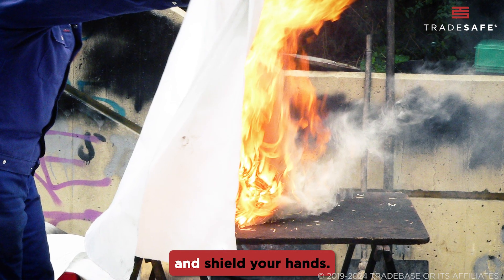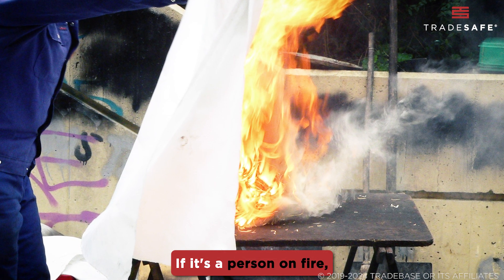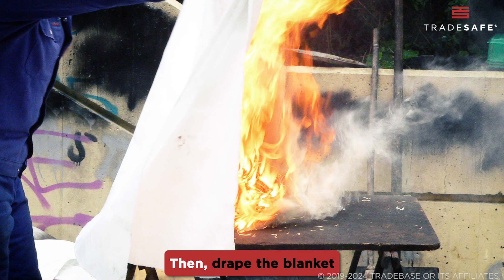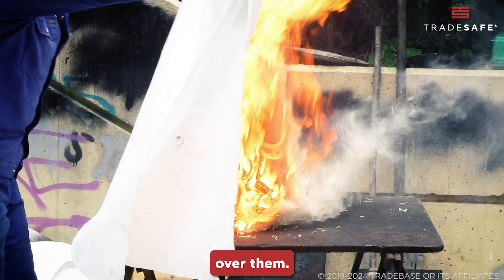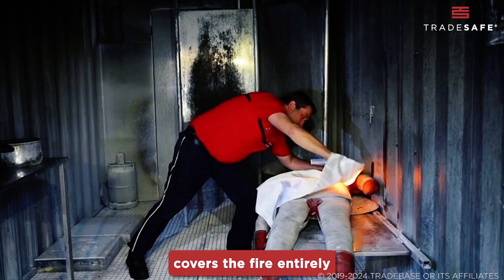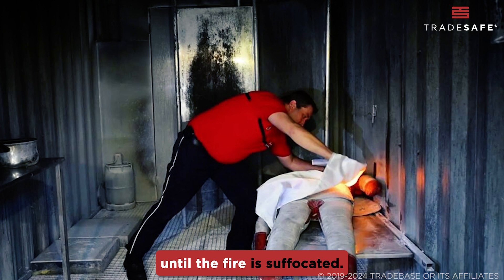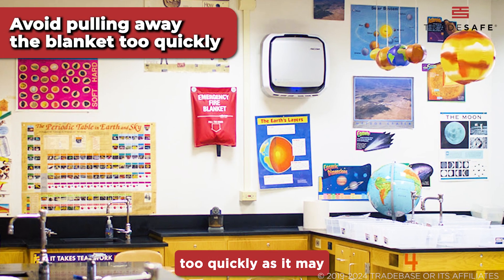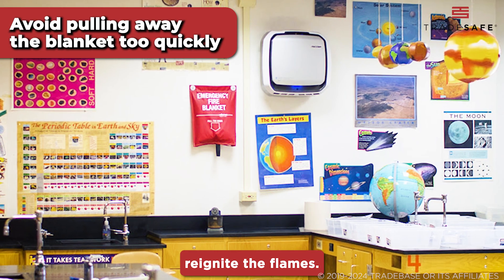Hold the blanket by the corners and shield your hands. If it's a person on fire, ask them to stop, drop, and roll. Then drape the blanket over them. Ensure the blanket covers the fire entirely and leave it in place until the fire is suffocated. Avoid pulling away the blanket too quickly as it may reignite the flames.